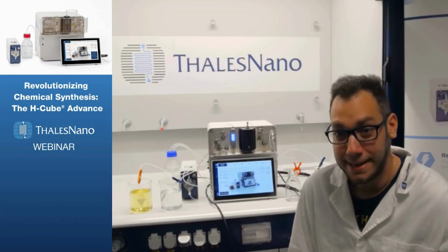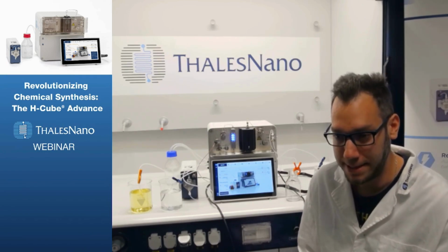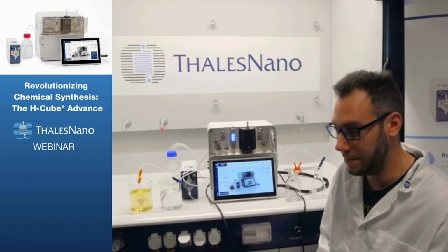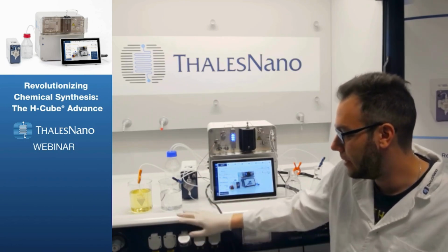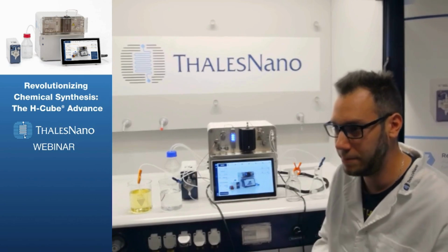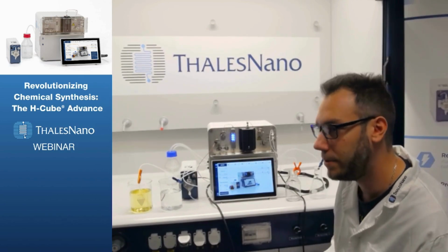Hello and welcome to the second part of today's webinar, which is going to be the live demonstration of the equipment in a real laboratory environment. So here you can see the most basic setup of the H-Cube Advance, consisting of one HPLC pump. We are using two different starting materials, a clean solvent, this is isopropanol, and a reactant, which is going to be a nitroindole to demonstrate a real chemical experiment for you.